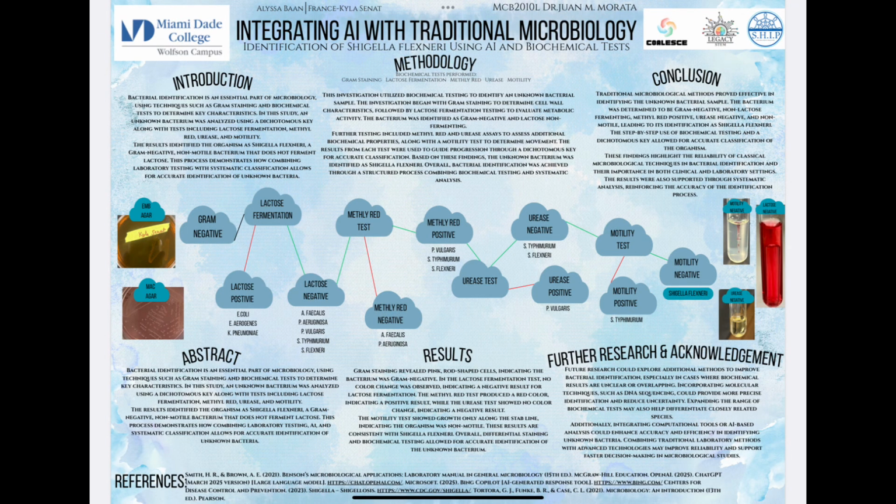Expanding the range of biochemical tests may also help differentiate closely related species. Additionally, integrating computational tools or AI-based analysis could enhance accuracy and efficiency in identifying unknown bacteria. Combining traditional laboratory methods with advanced technologies may improve reliability and support faster decision making in microbiological studies.